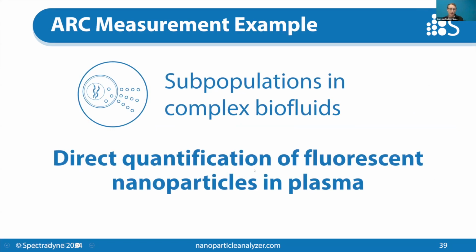Right. As a final example, I wanted to show you how the ARC can be used to quantify particles, nanoparticles, in extremely complex samples.